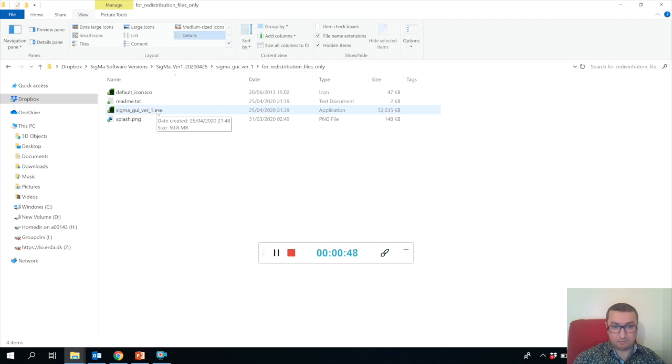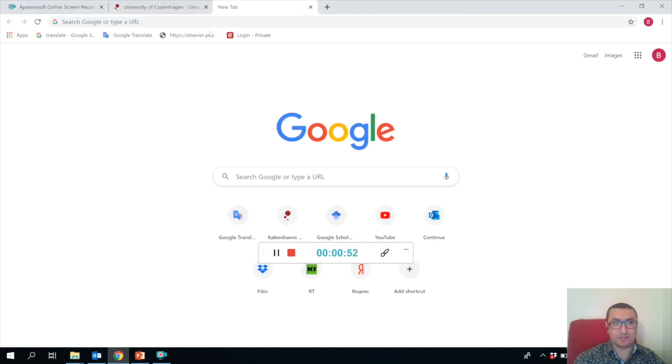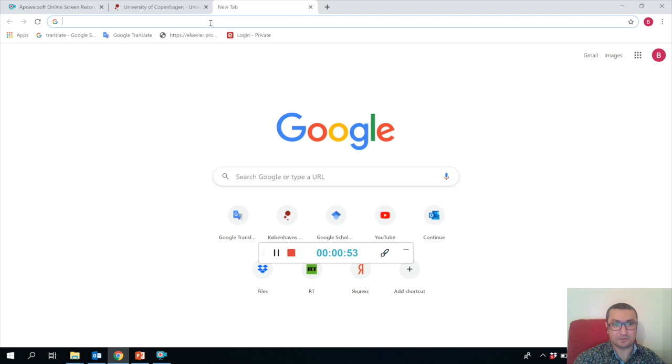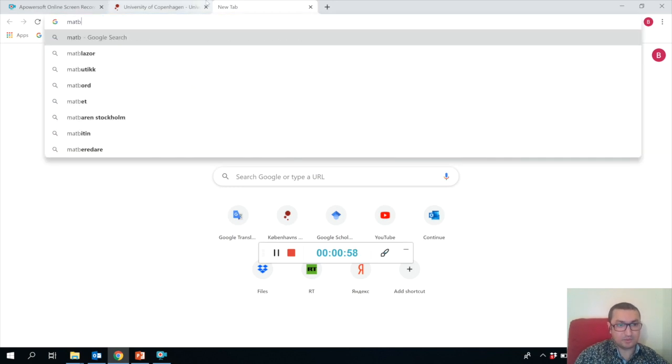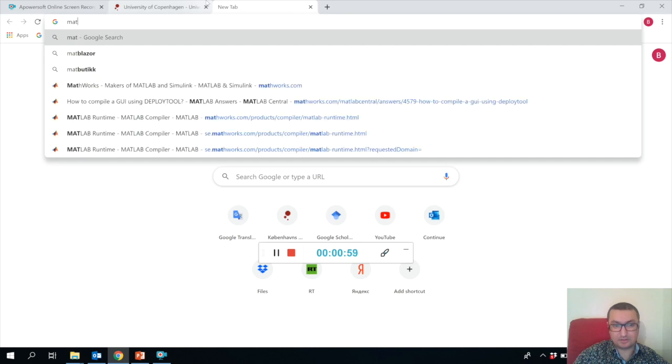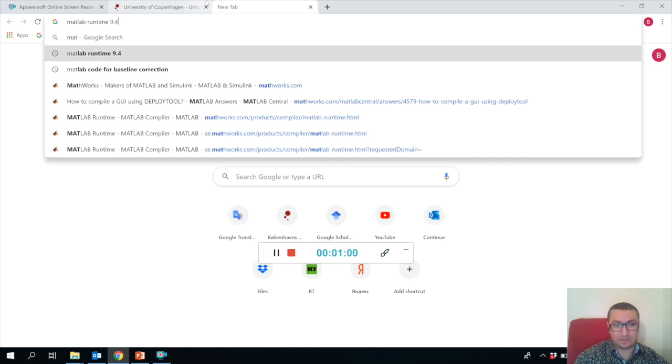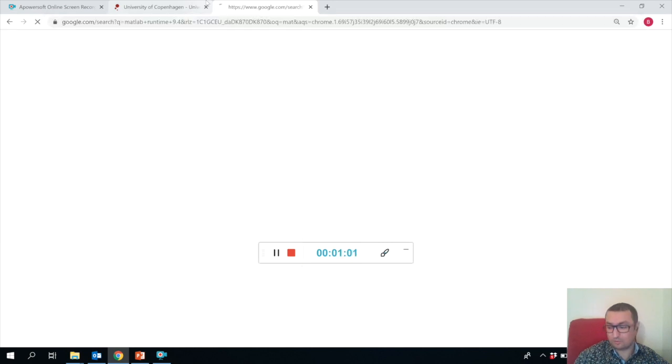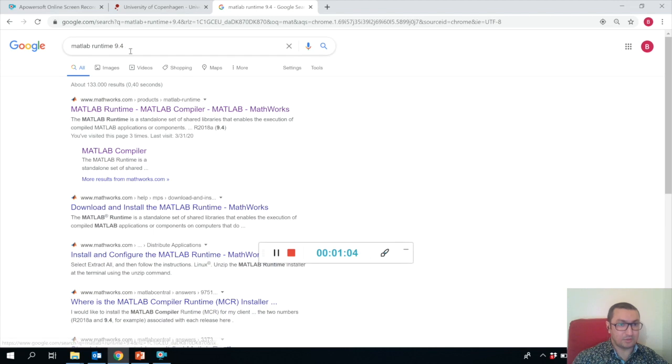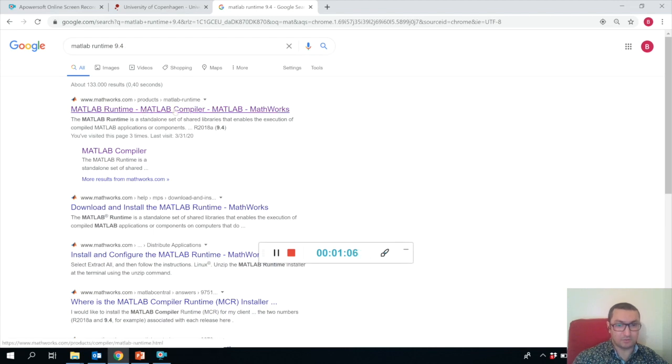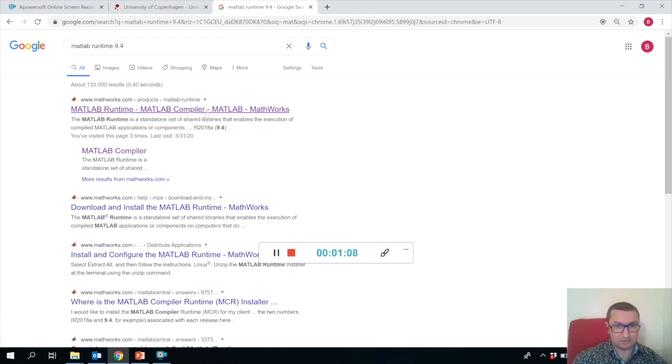But before you do that, you have to have something called MATLAB Runtime installed on your PC. The MATLAB Runtime you need is version 9.4, so in order to install it, please go to the MathWorks website and install it.